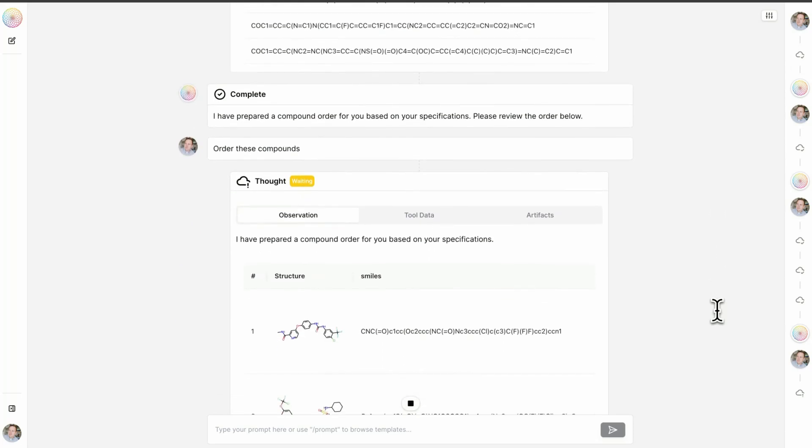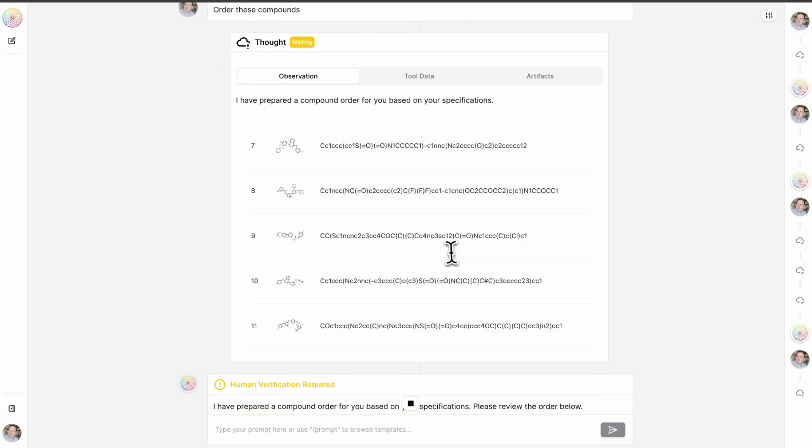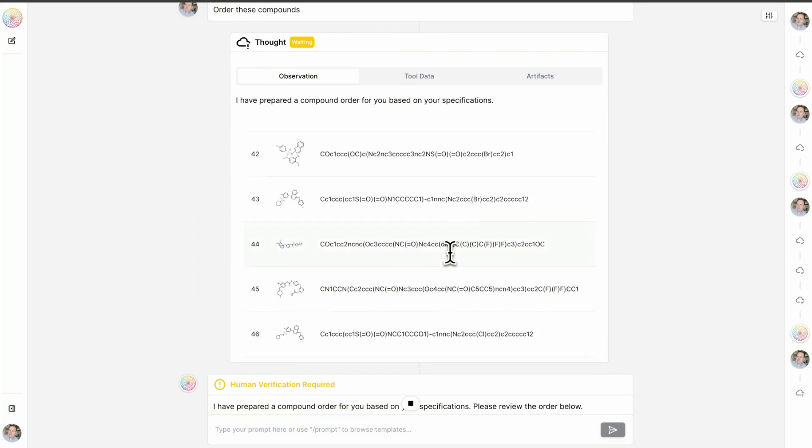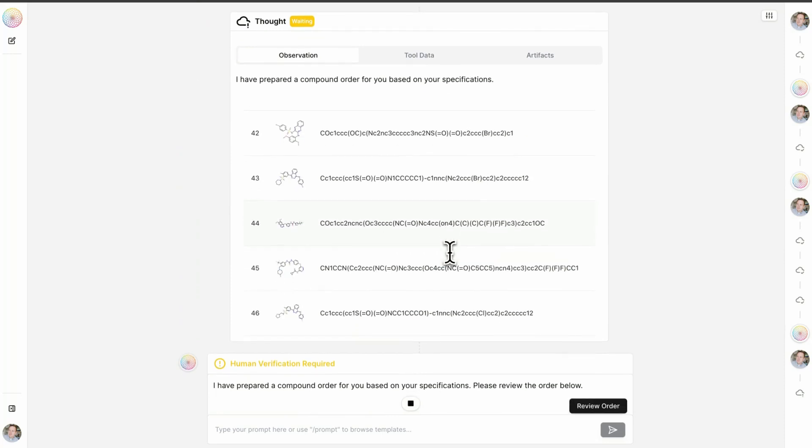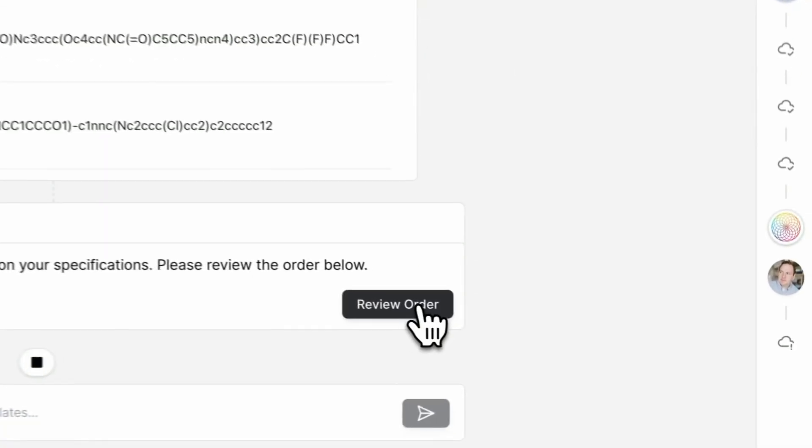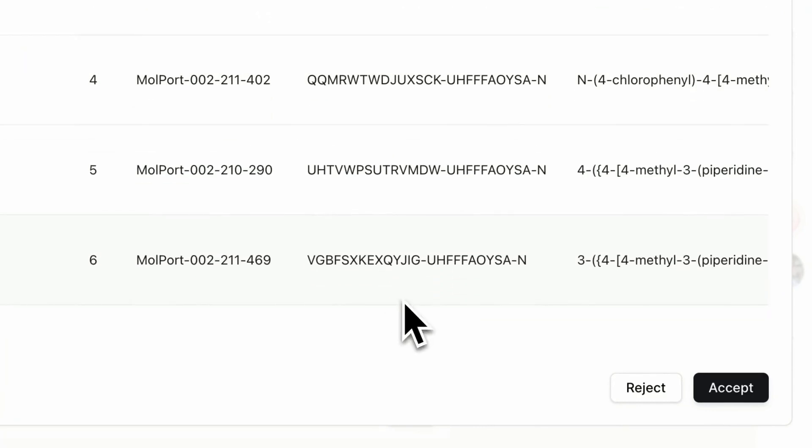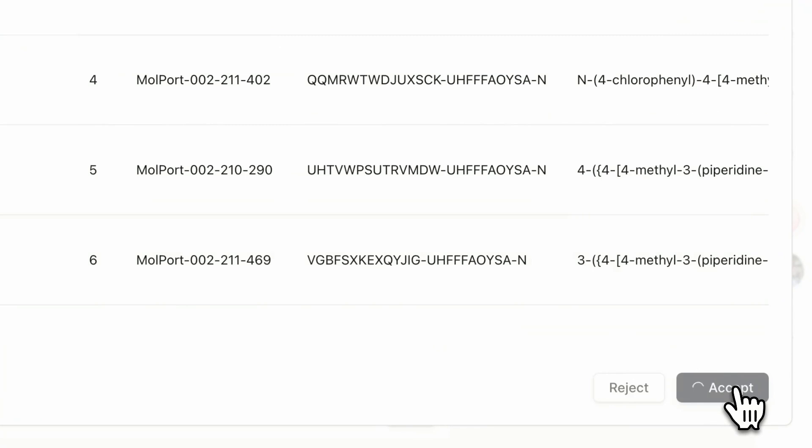Lowe has fulfilled this request, and we can see that of the 50 compounds that we wanted to order, 46 are available externally. And because we're interacting with the outside world, we're having a human confirm this order, so I will go ahead and click accept. Done.